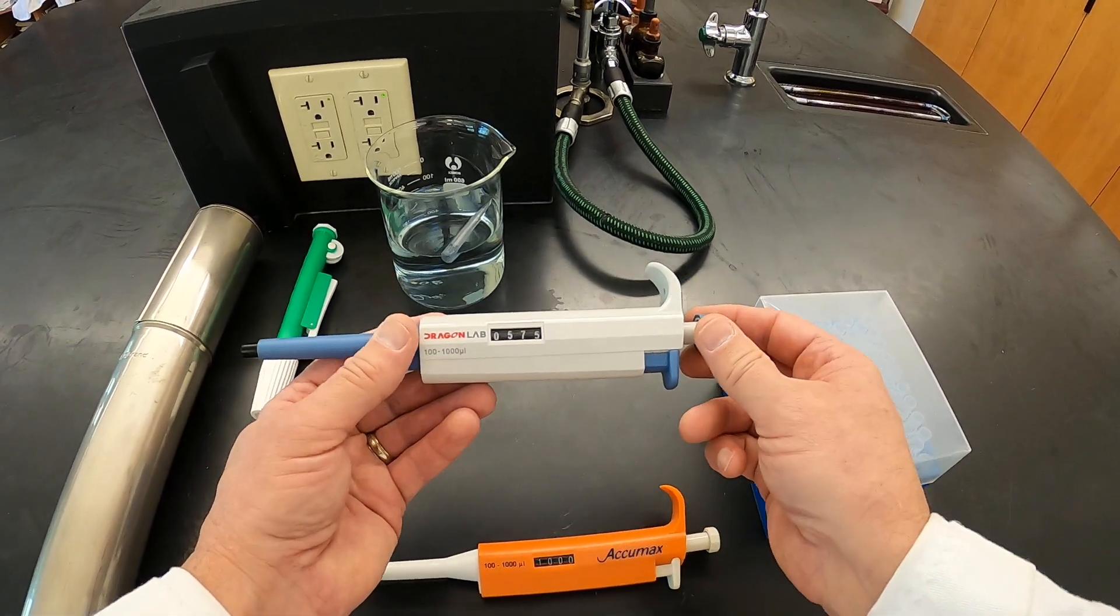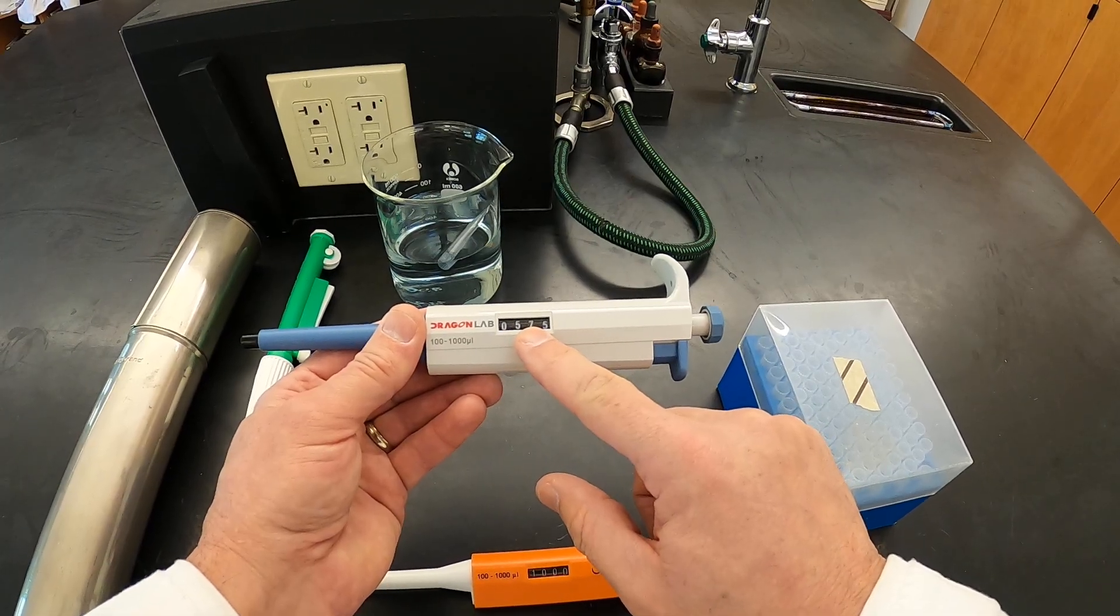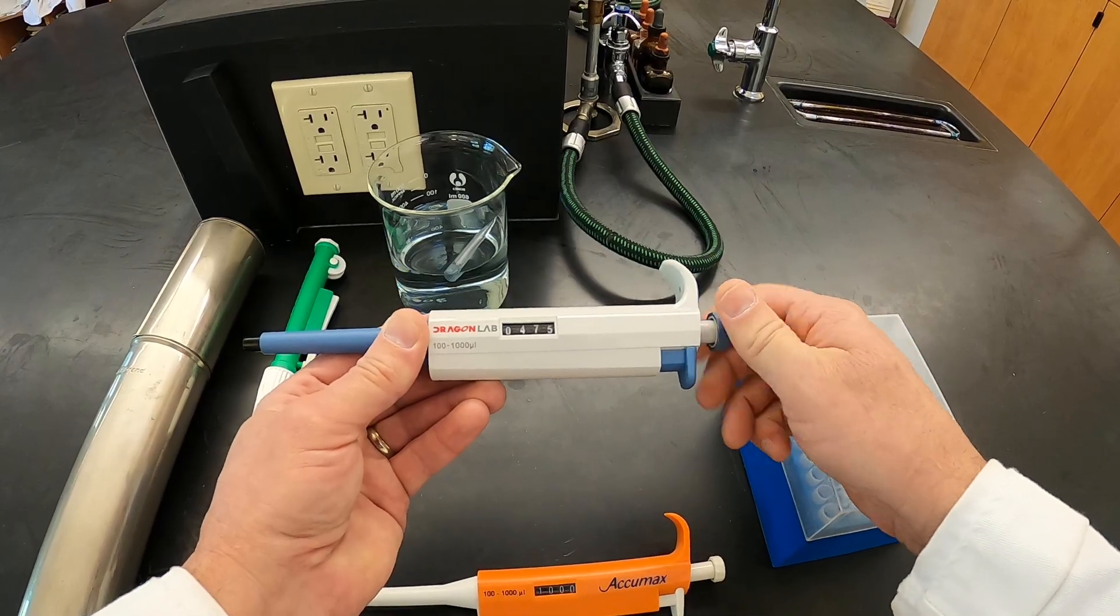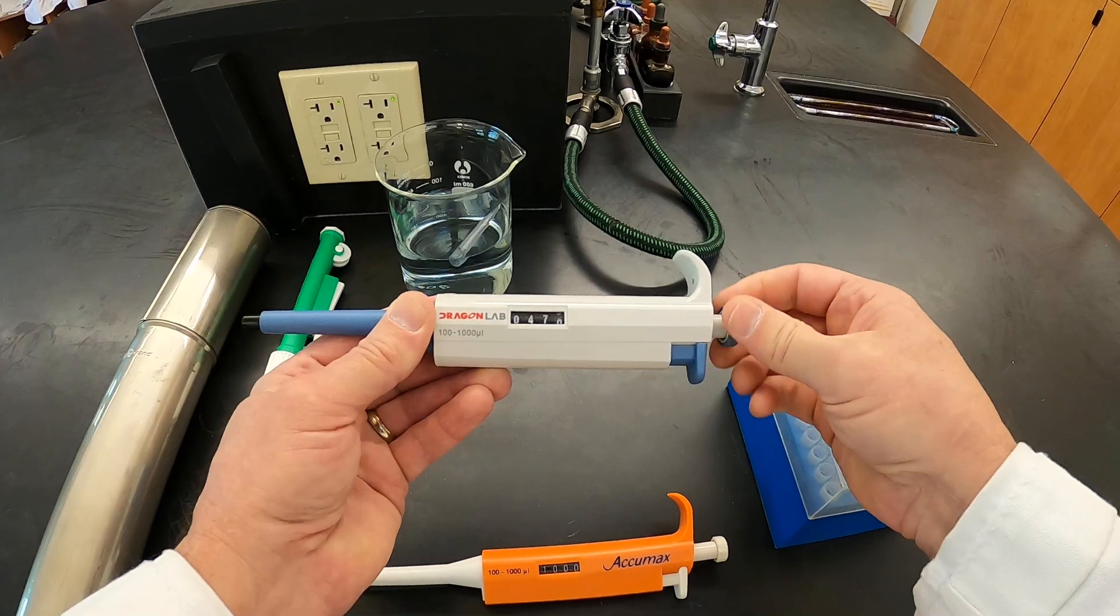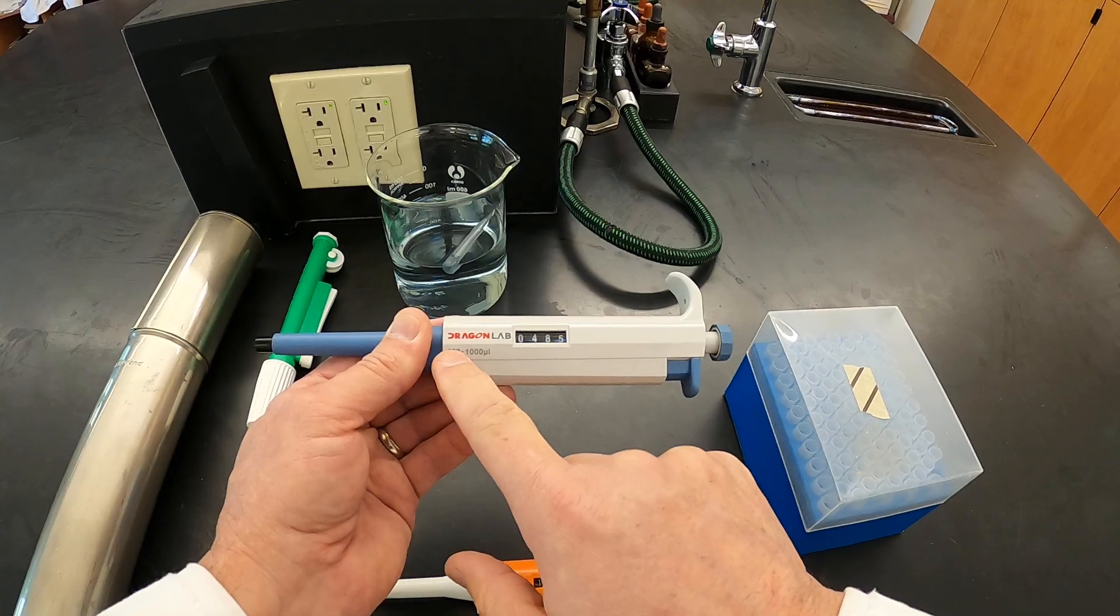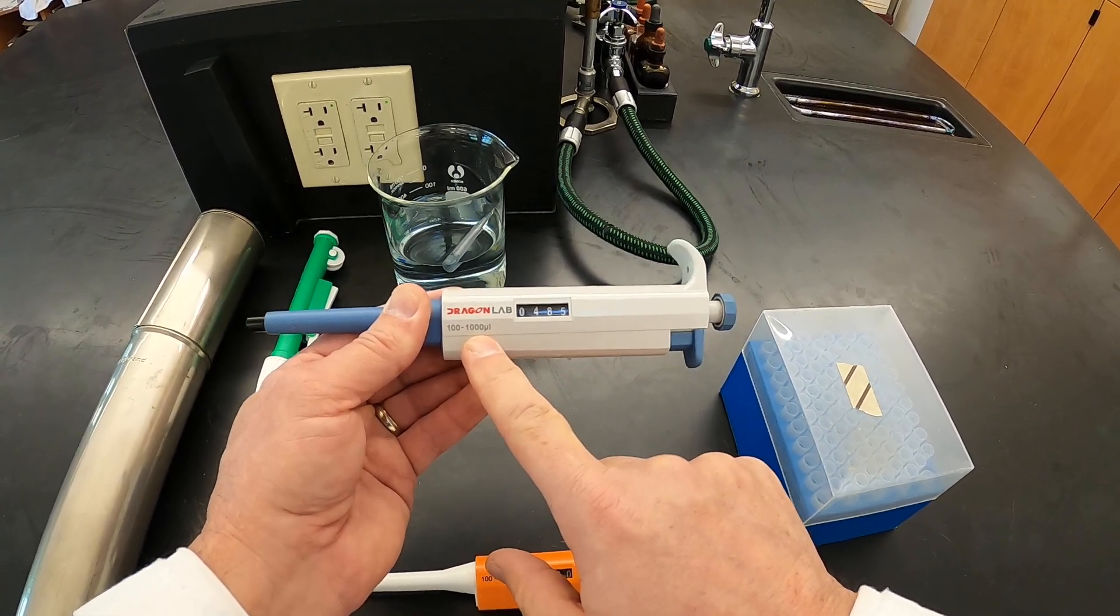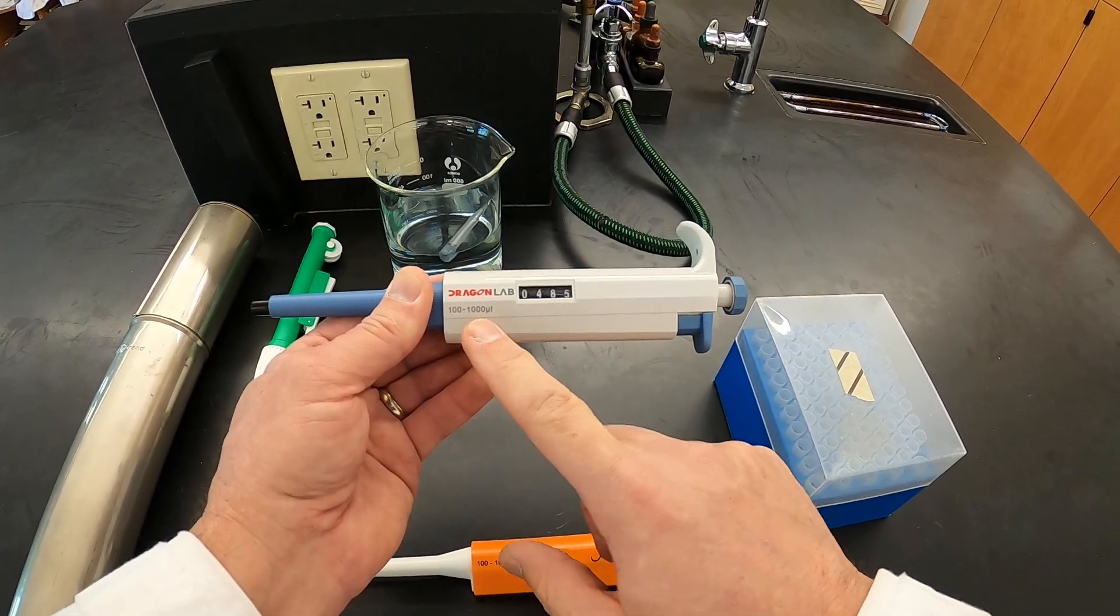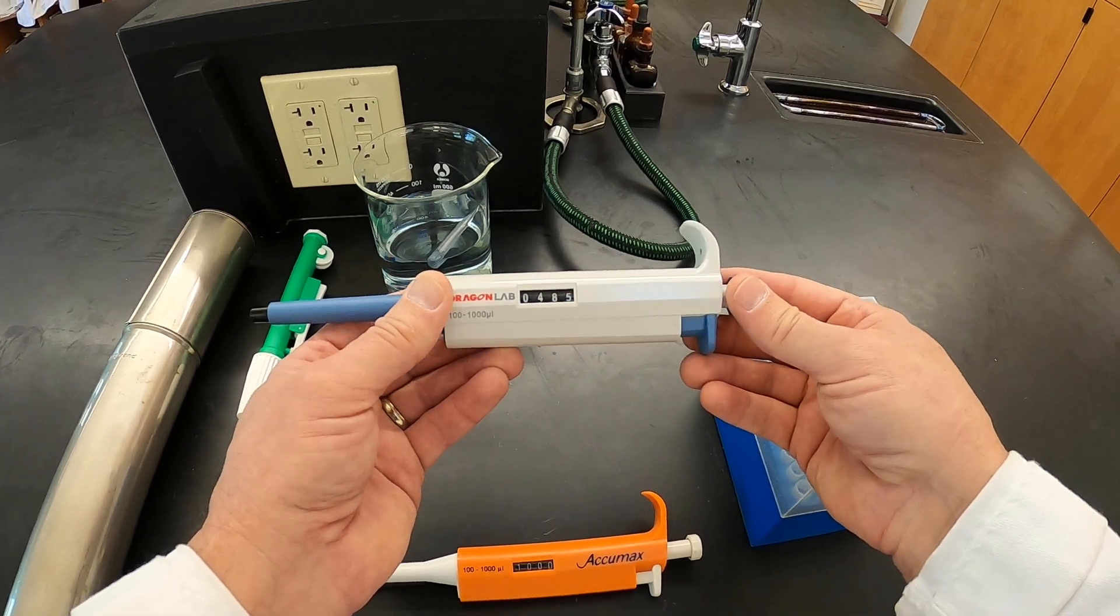The way that you adjust the values here in the window is to twist the plunger. So we can twist the plunger to decrease the volume, we can twist the plunger to increase the volume. One of the things you want to be really careful with though is to not decrease the volume below the stated minimum or above the stated maximum because you will damage the pipette. So just be very careful to make sure you are not trying to set the pipette outside its minimum or maximum range.